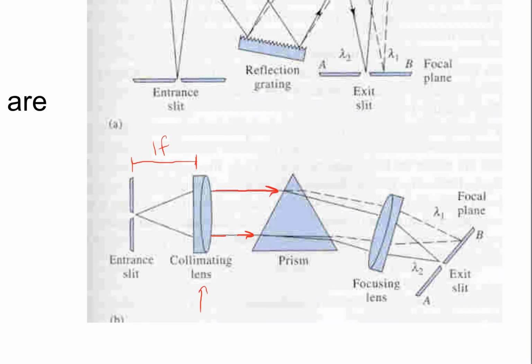Like, for instance, a laser beam that you can shoot across the room. It stays as a nice thin pencil of light, a beam of light. That light is highly collimated. All the rays traversing the room are parallel to one another. That's very different than a flashlight or a light from a tungsten lamp in your closet. In those sources, the light just spreads out in many different directions, right?